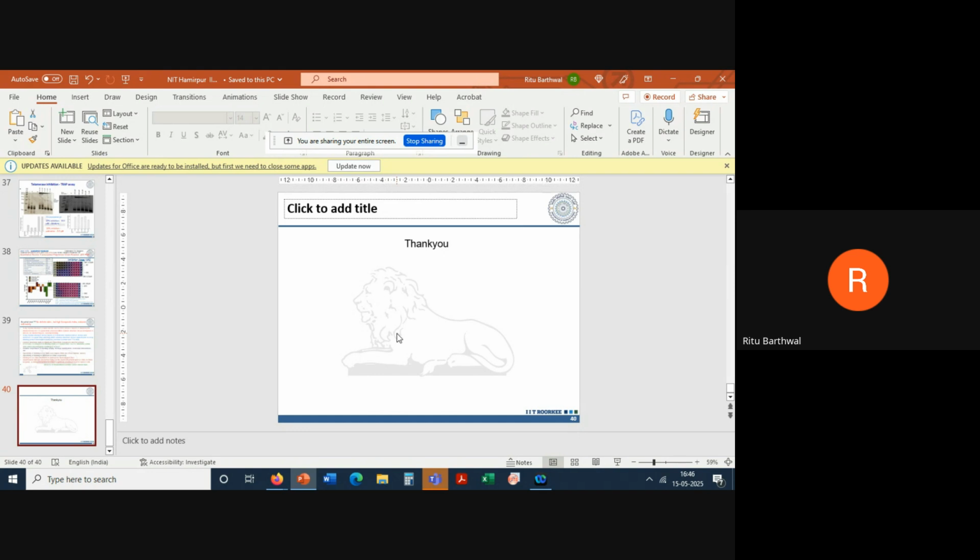From there only, by the way, we have taken 2,6-diamido anthraquinone. They did it with piperidyl, morpholinyl. The only thing is they did not do some of the studies which we have done by NMR. They took aromatic rings, piperidyl, and also diethylamine and monoethylamine. So they are able to pinpoint, like you said, whether the CH3 group gives a more potent molecule as compared to the piperidyl or morpholinyl.